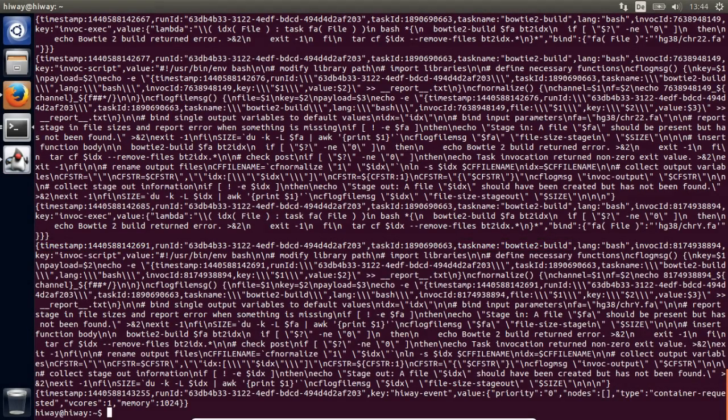If we wish to re-execute the workflow with parameter settings identical to this particular run, we could dispatch the stat log to Highway for re-execution. The command for this would be highway -w, then the stat log, -l log -s log.json.